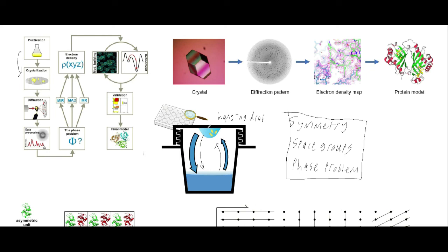You want it to evaporate very slowly, and that will cause the proteins, because their solubility will reduce as their concentration increases, because you're losing solution up here, to slowly start to form arrangements, into crystal lattices, and eventually these will turn into crystals that look something like this. There are various different shapes that they come in, but this is an example of one of them.